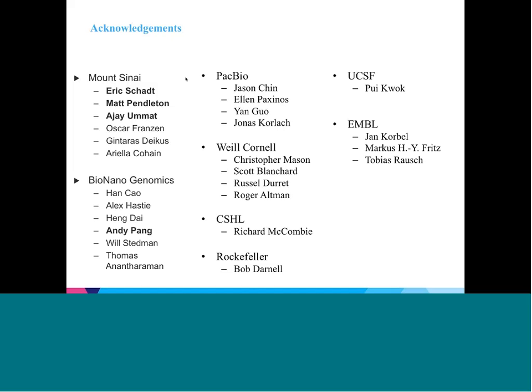I will also add a further comment that the IRIS instrument does come with 3 lasers already on board, and we are working to get a 2-color assay up and running, hopefully by end of this year, which will allow you to do multiple nicking enzymes at the same time rather than subsequently with the single channel. So we definitely have an eye to increasing nicking enzymes and even other labeling techniques that we're developing here.